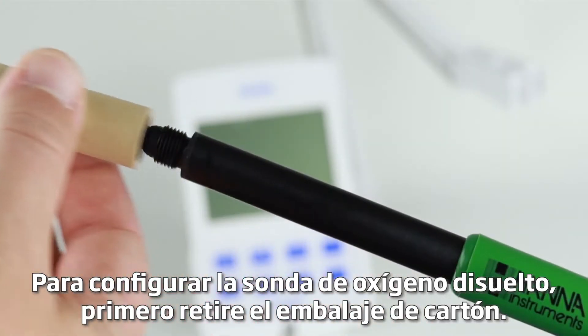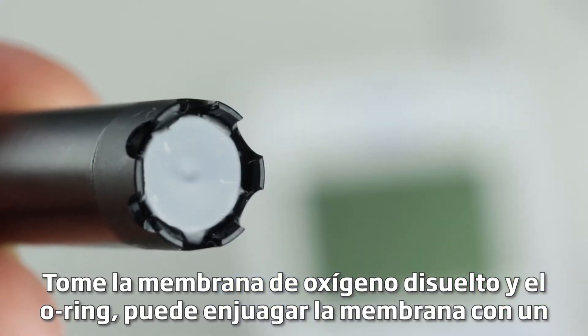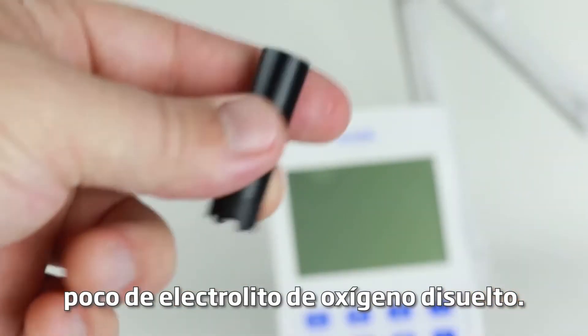To set up the dissolved oxygen probe, first remove the cardboard shipping tube. Take a dissolved oxygen membrane and O-ring and rinse the membrane with some dissolved oxygen electrolyte.